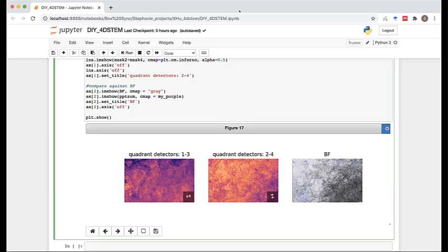The second question is if this would work directly with the DM, with the Digital Micrograph. And I guess the answer as is would not. So you have to do a few modifications and then create, outside of Jupyter Notebook, a .py file, basically copying the information they have from the kernels that Stephanie showed. There is a nice and quick tutorial to do that on Gatan's website, and you can use that for a couple of lines just to talk with the DM, and then you can run everything on that. And also the data will be available there, so you can download it. If you go to Stephanie's GitHub, it will be there.